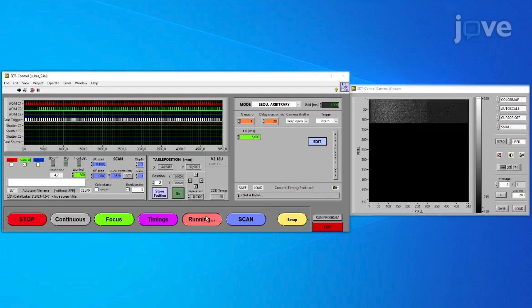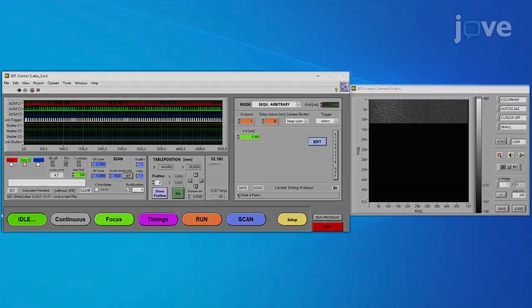Choose the number of repeats to be large enough to ensure photobleaching of at least one fluorophore per probe within the field of view, permitting stepwise photobleaching analysis to discriminate single-molecule signals from aggregates.